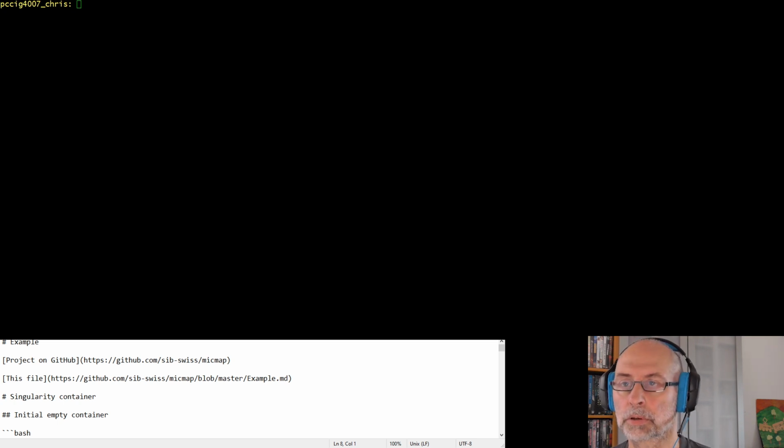Hello, this is a series of videos which will describe the use of the MicMap tools. There will be, I think, 5 videos in total, at least that is what is planned now.